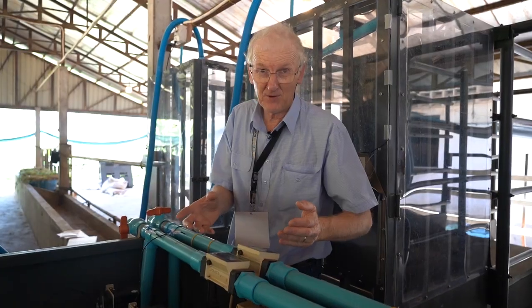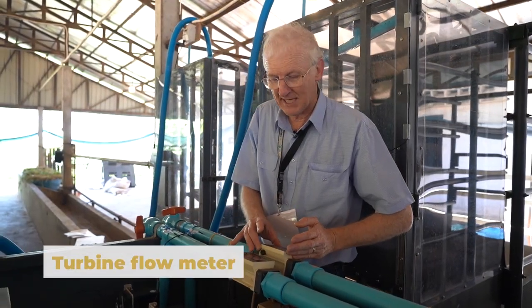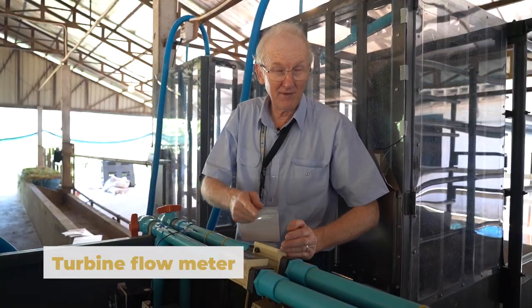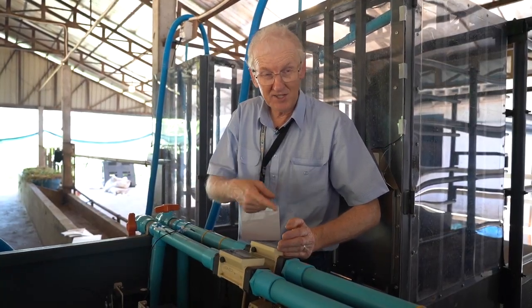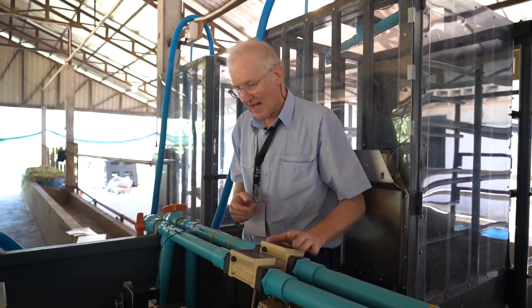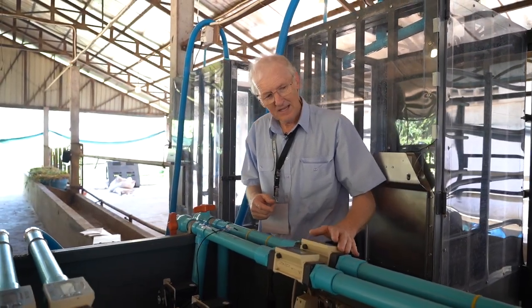Different flow meters have different principles. These are turbine flow meters, and they in effect count a volume of air. There's a turbine inside that rotates. Every rotation is a certain volume of air. So our flow meter is there.